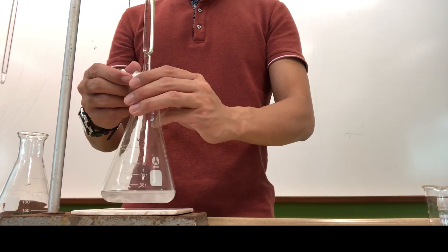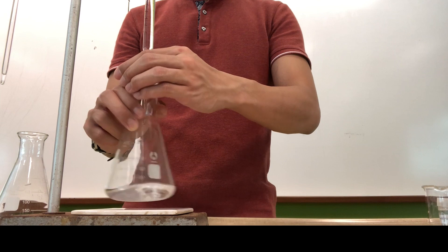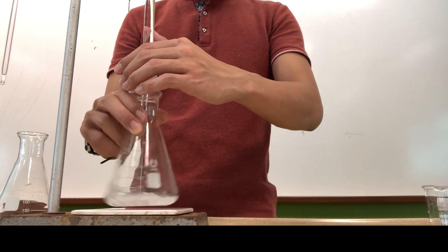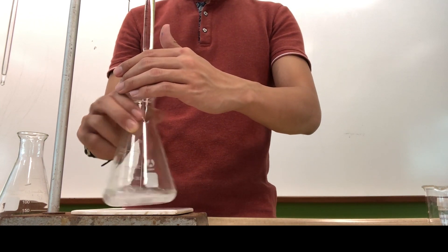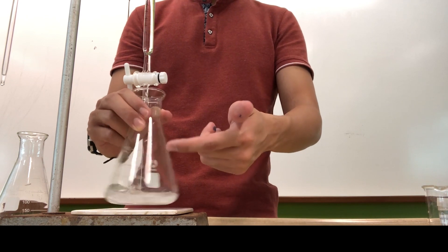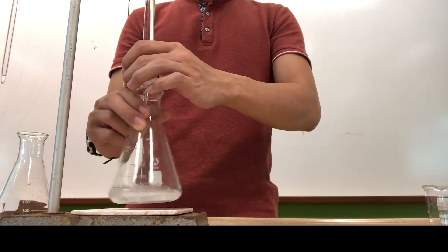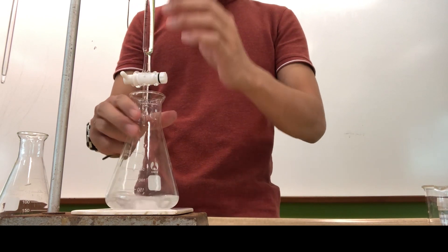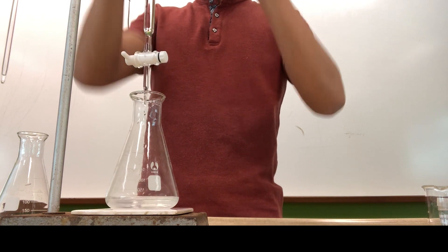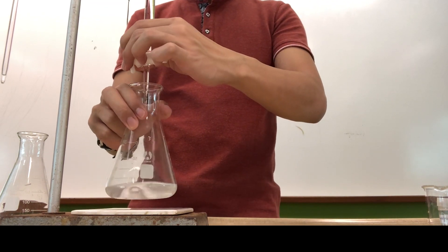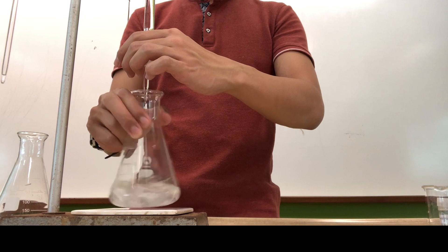Now that you have set up your titration setup, it's time to add in the titrant. Most students at this point in time will actually dispense the titrant in with swirling and hope to see a color change, then they will turn it to dropwise and continue to add until the color change is permanent. However, that is actually not a recommended course of action.